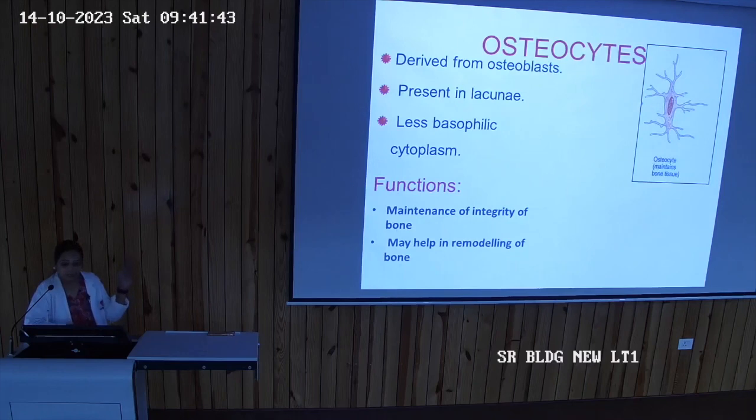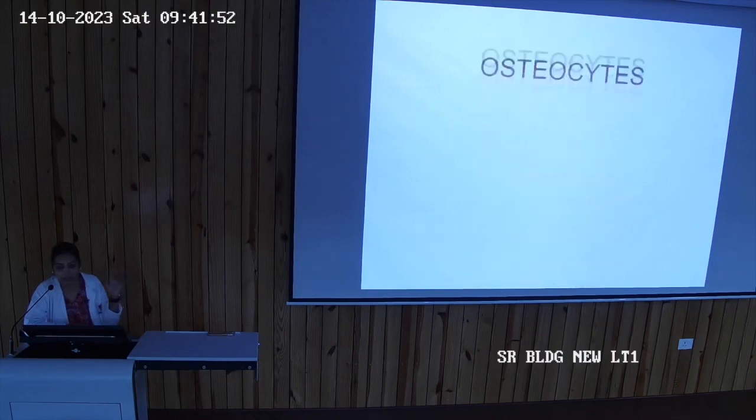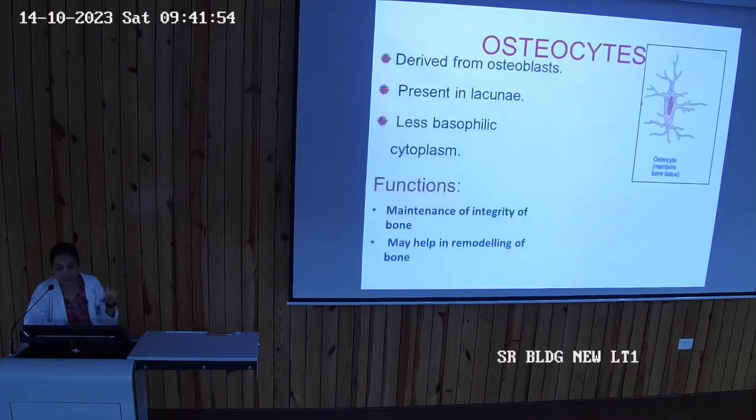Now if we look back at the osteoblast, the main differentiating feature is that it has a larger, rounded nucleus, which is eccentrically present. Here, the osteocyte has an irregular appearance with a centrally placed oval nucleus, and it has processes radiating outwards from its cytoplasm.